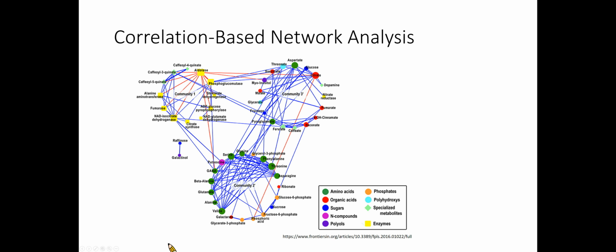One of the main features of biologic data is the high level of correlation existing between the different elements. Part of these relational patterns is due to the metabolites that belong to a common metabolic pathway. In other cases, however, the observed correlation may be due to other causes like global perturbations, specific perturbations, and/or the intrinsic variability of metabolomic data.